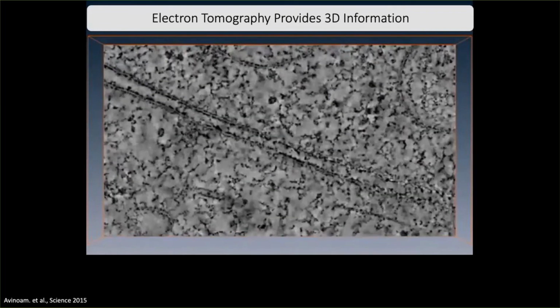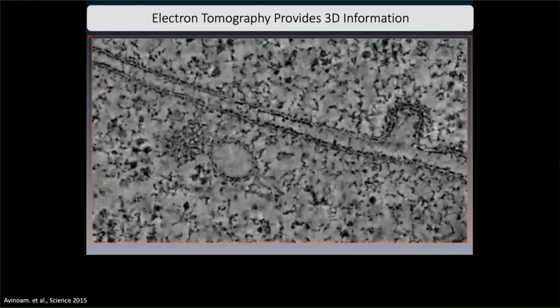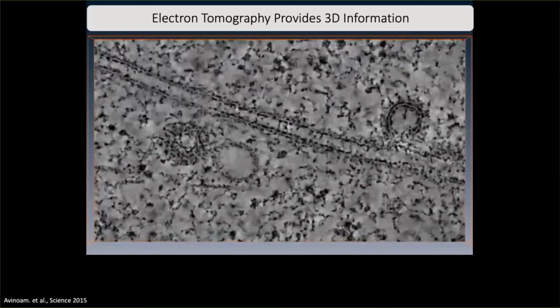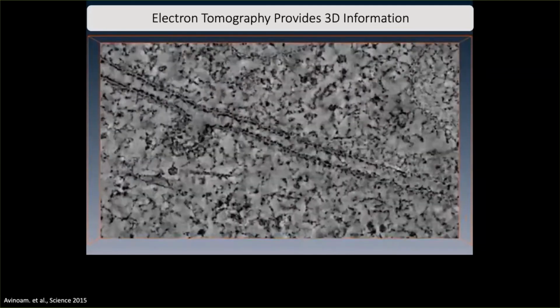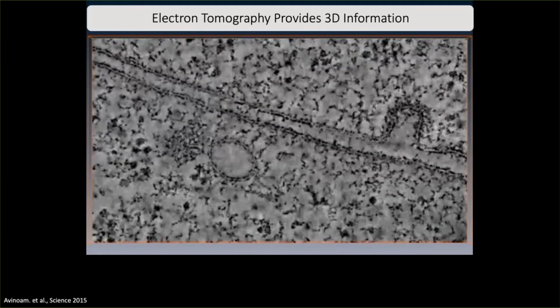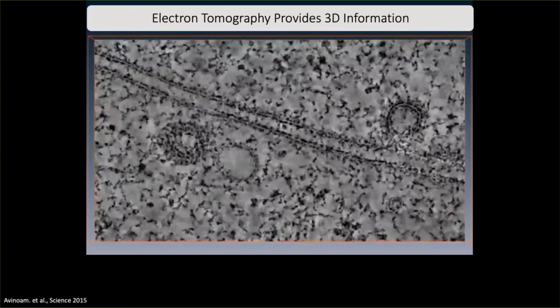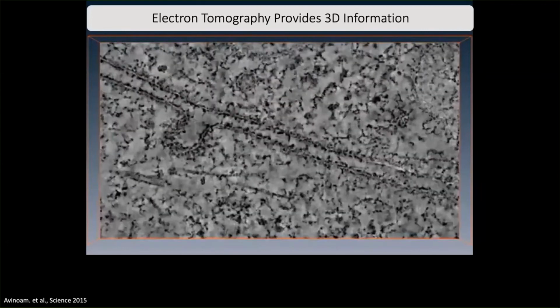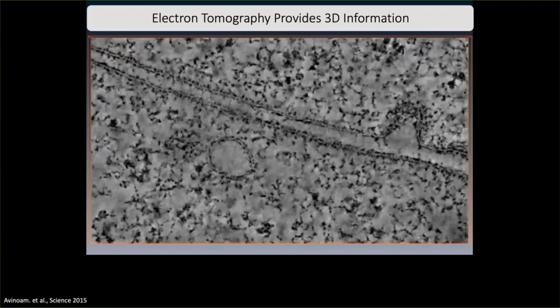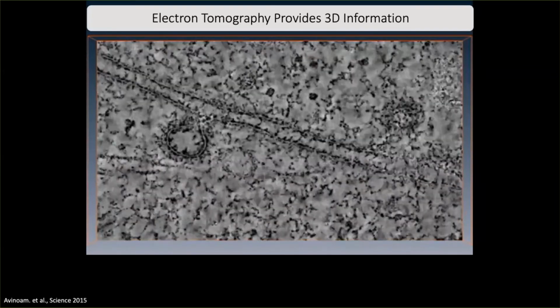So the fluorescent information here gave me both molecular composition, but also time. So while we might think that correlative microscopy, simply stated, would give us the dynamic information and the high resolution information together, very often the fluorescent signal or combination of fluorescent signals gives us actually a surrogate for time. Because we know how the fluorescent signals behave one with respect to another, we can use those to deduce at which times these different objects are relative to one another.